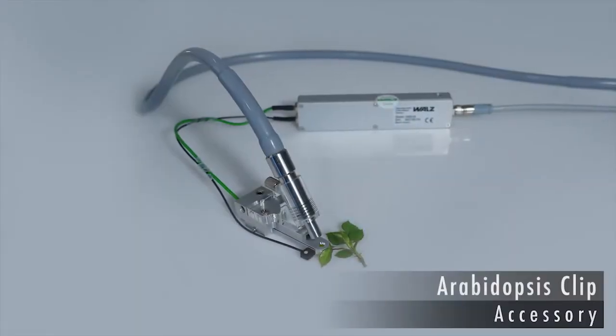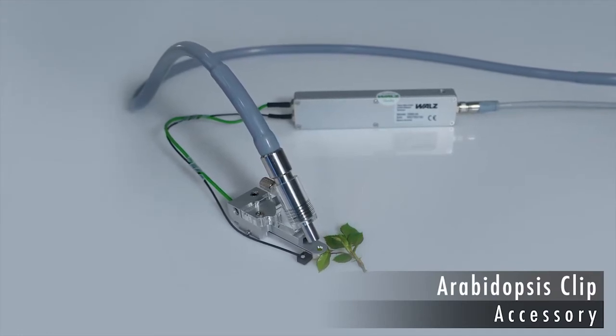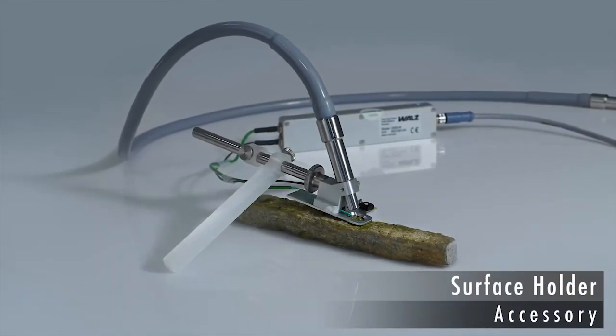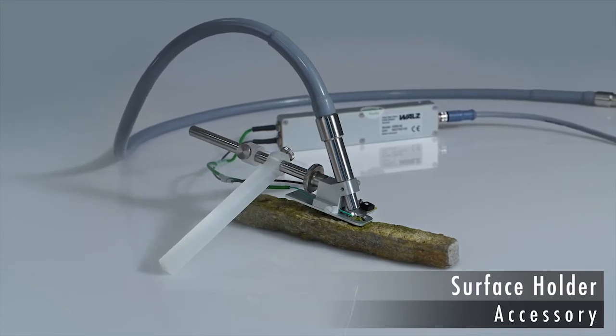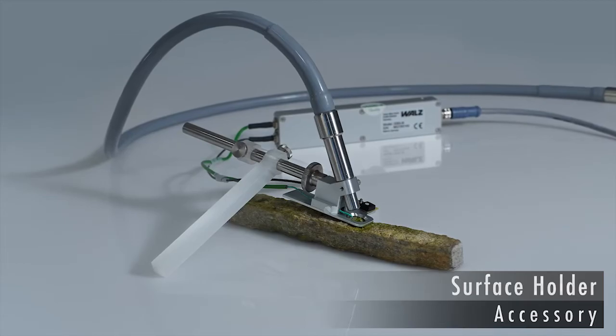The Arabidopsis leaf clip has been designed specifically for measuring small leaves. The surface holder is a positioning device for the fiber optics, most often used in studies of mosses, lichens, and photosynthetic crusts.